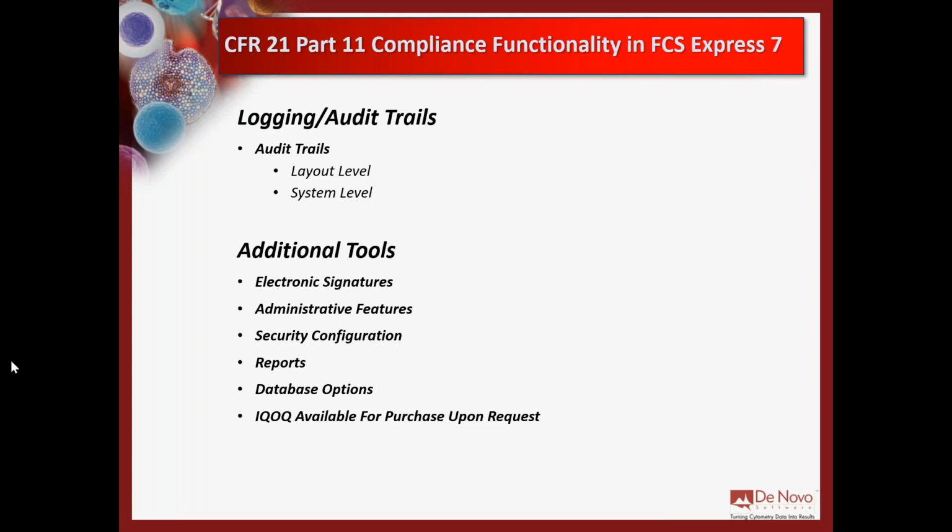So FCS Express is pretty flexible. We do have the ability to work with our own database that we create, but we do really recommend that folks are using a SQL database. There's a lot of different ways that FCS Express can connect and work with that. And again, our team can help you figure out what is the best database option for you.